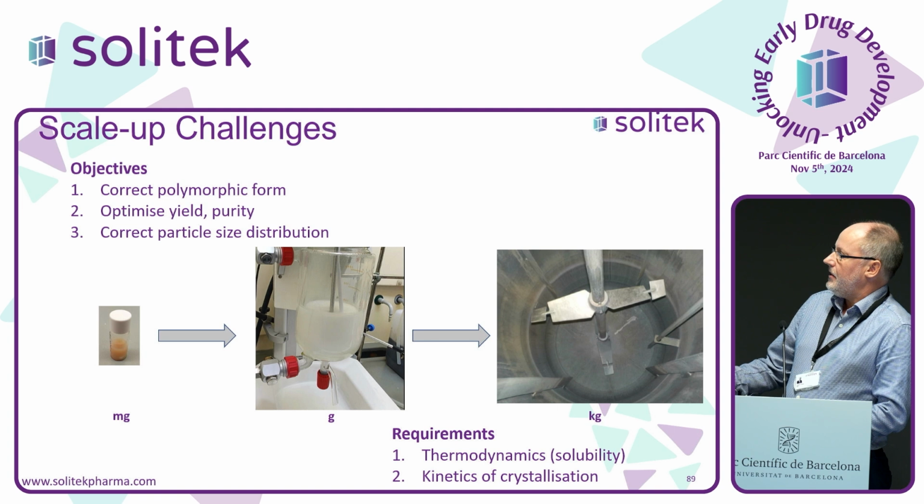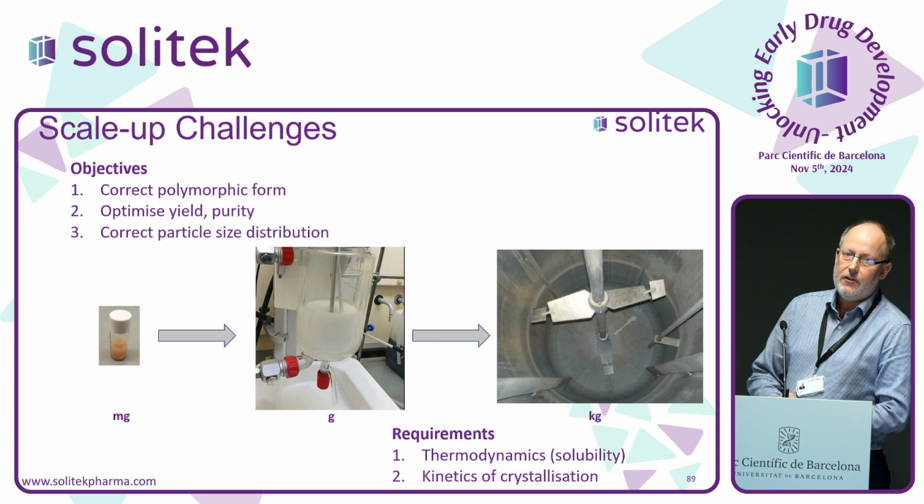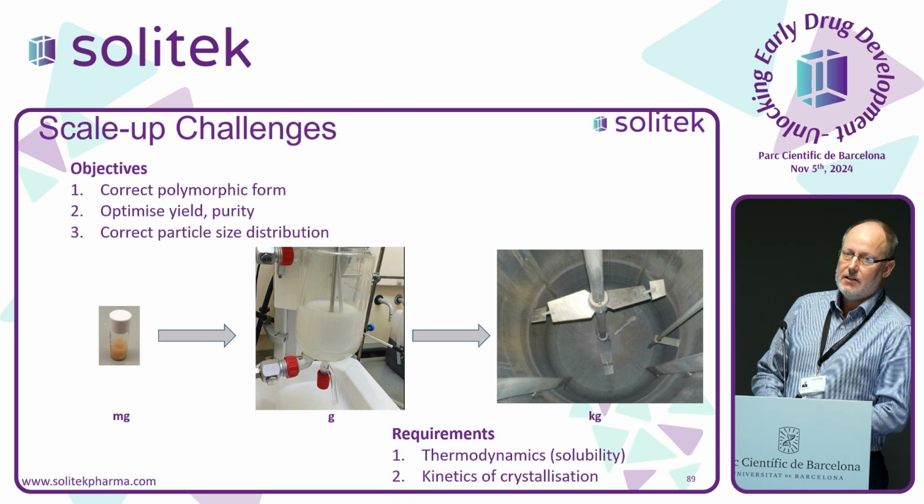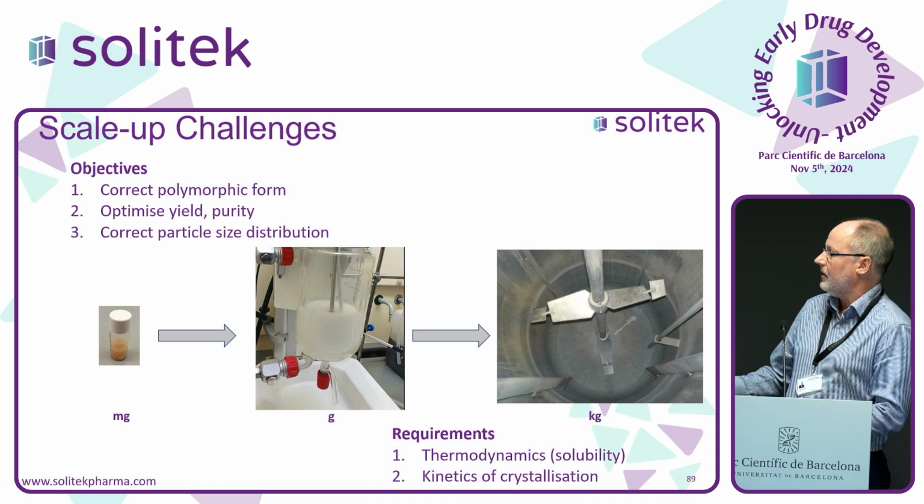First of all, the objectives: correct polymorphic form. Obviously, we need to optimize the yield and the purity. And correct particle size distribution, or at least an understanding of the factors that will affect particle size distribution.